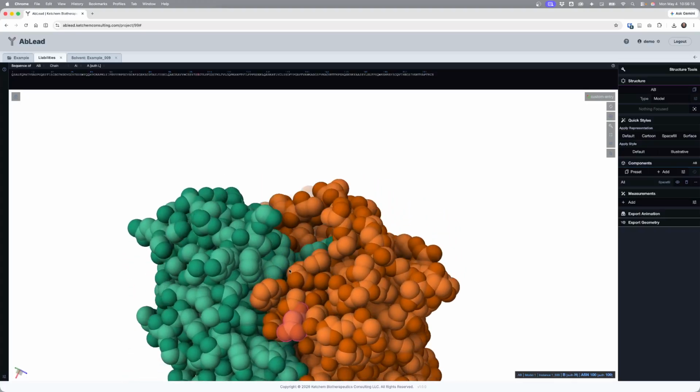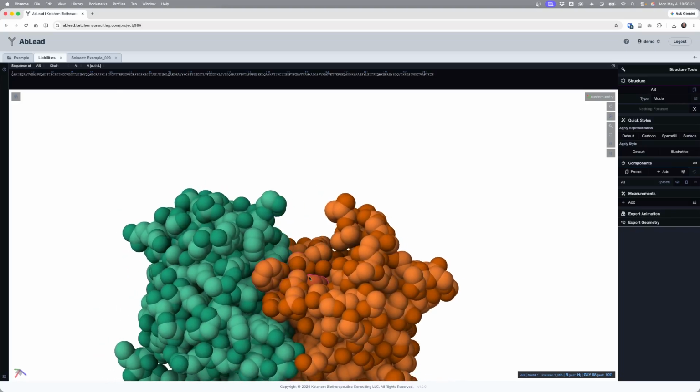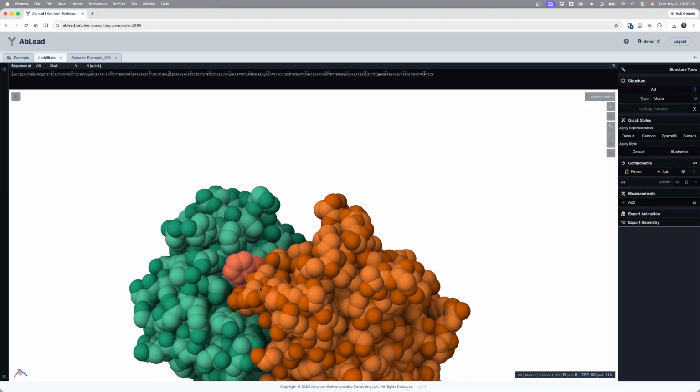And you can look and see that indeed that pyrrole ring is mostly buried. There's probably not much range for flexibility of this loop. It doesn't stick up out of the core FV. This heavy chain is actually quite short, so it limits the amount of flexibility that this tryptophan could have. So low risk for oxidation and degradation of this tryptophan.